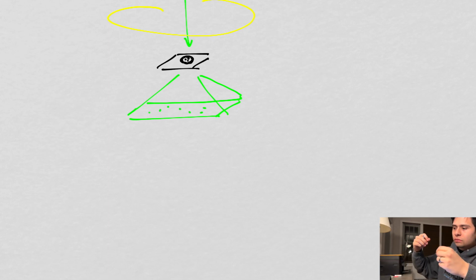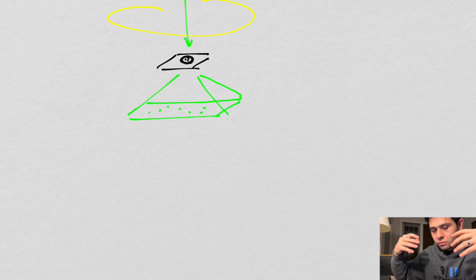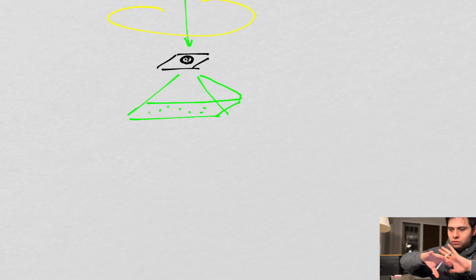And so if you are sending an electron towards a target, you can think of it as a wave traveling towards the target. When it comes in contact with the target, a sort of rippling effect, if you will, occurs within the wave, and what you get is a specific wave thumbprint, if you will, of the orientation of the protein that it's bombarded with.